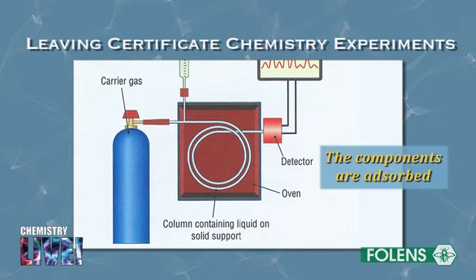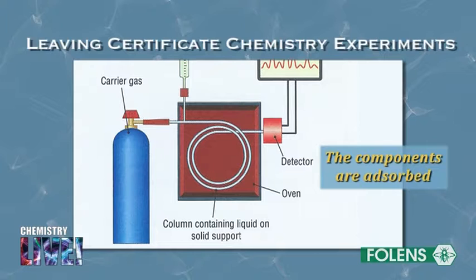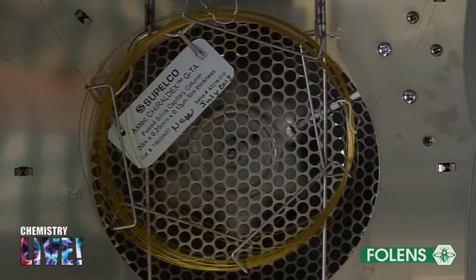The components of the mixture are adsorbed to different extents on the stationary phase in the coil. Therefore, the various components in the mixture are separated out as they flow through the column.